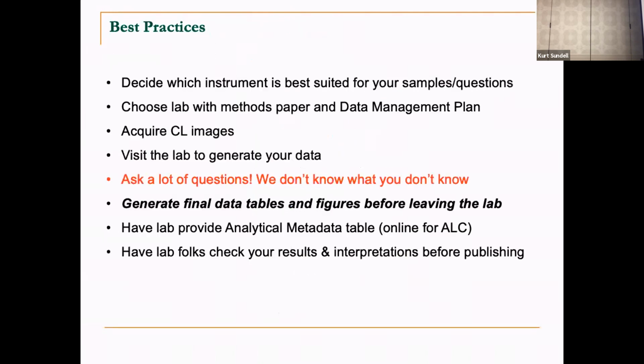Okay, so some best practices here. You've got to know what's best for your samples. All of you had different types of projects, which is so cool to see. But this means that it's on you to make the right choice. If you're asking a question about a geologic timescale, please don't come to our lab. It's very stressful. But maybe screen your analyses first in our lab. Choose labs that have published methods papers and data management plans. This is required for NSF reporting.